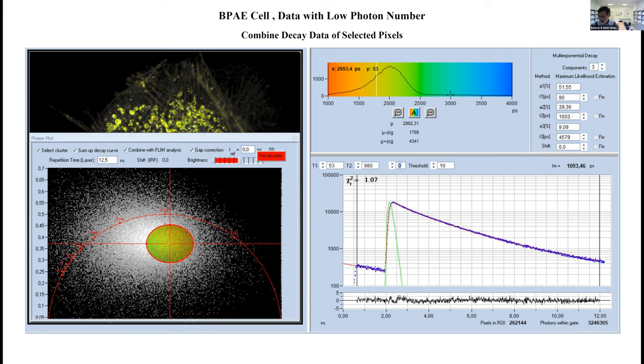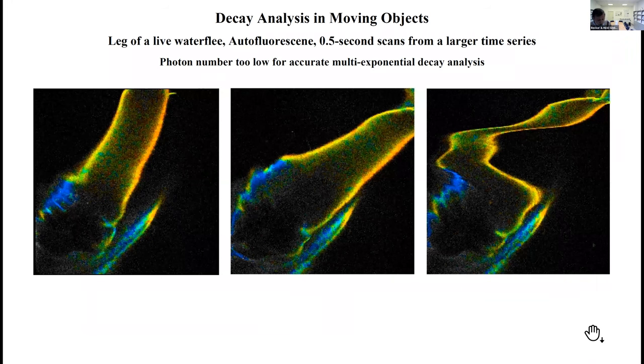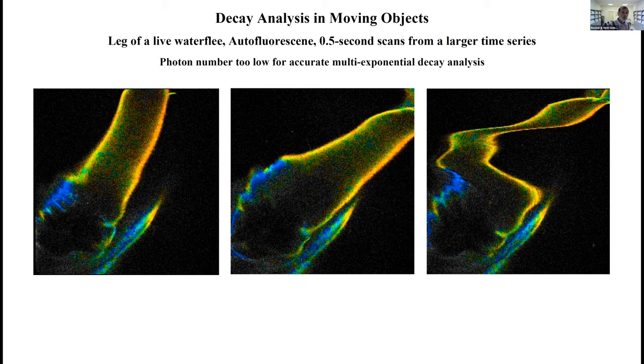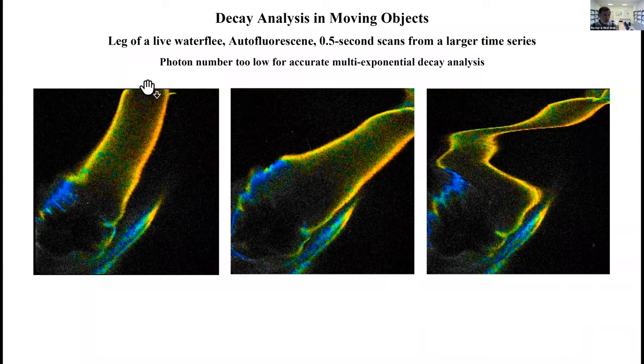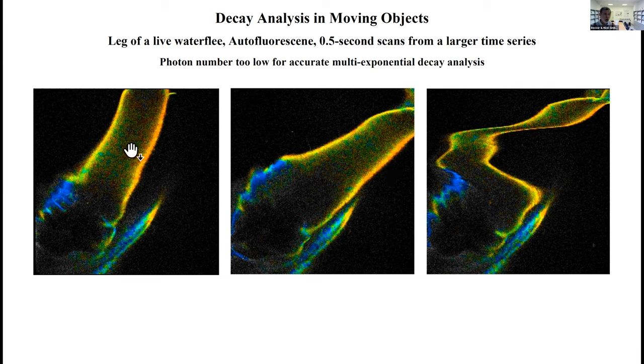What can we use it for as well? A common problem is decay analysis in moving objects. Many people say it's impossible by TCSPC FLIM because the acquisition times are too long. This is an example. This is the leg of a live water flea, and these are 0.5 second scans from a larger time series. You see the leg is moving. Sometimes you get a reasonable image of the leg, sometimes it's totally distorted.